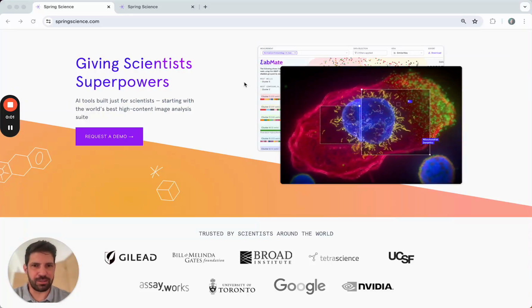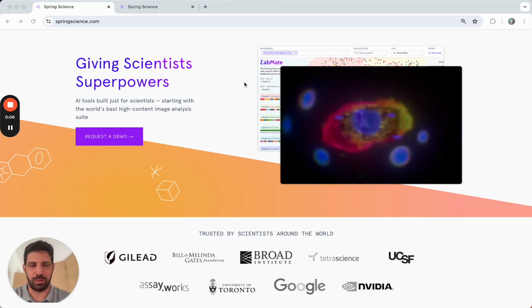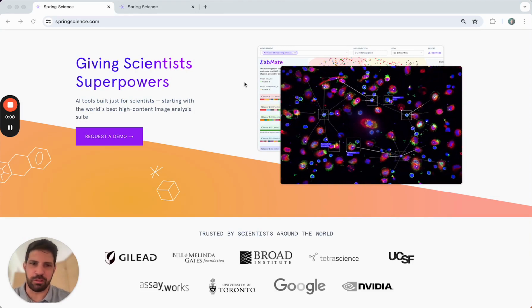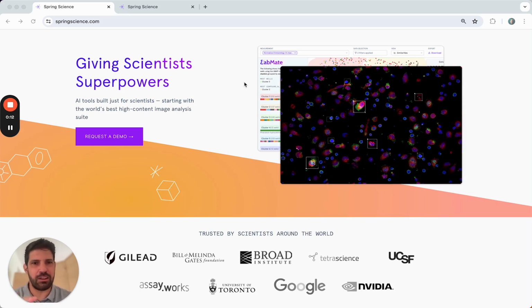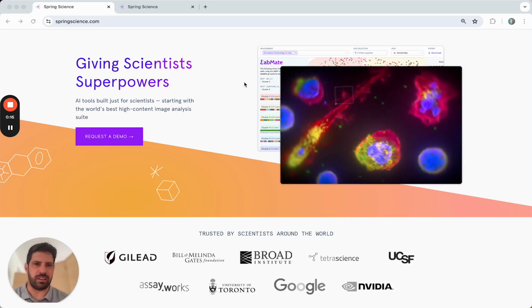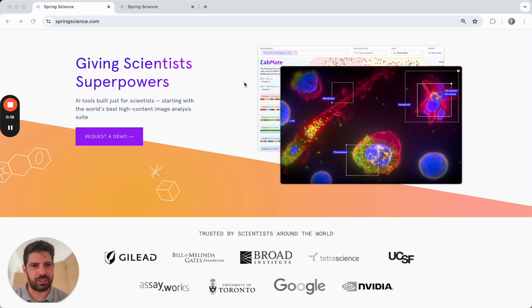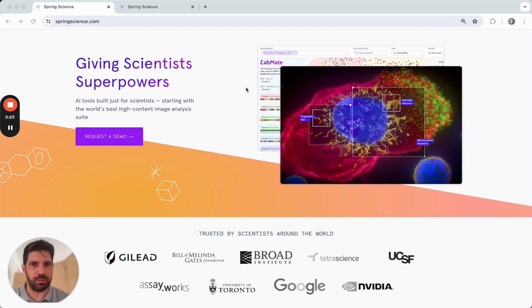Hey, I'm Ben Kamens, the founder of Spring Science. We build AI technology to give scientists superpowers, and I'm going to take you through a very fast-moving demo here of our starting point, which is an AI-driven image analysis suite for high-content imaging data, running single-cell analysis at a very big scale, and generally pulling powerful information out of biological images.